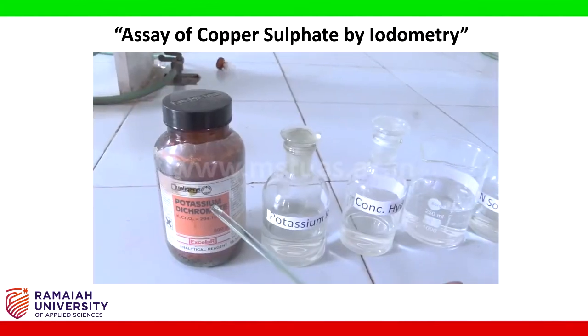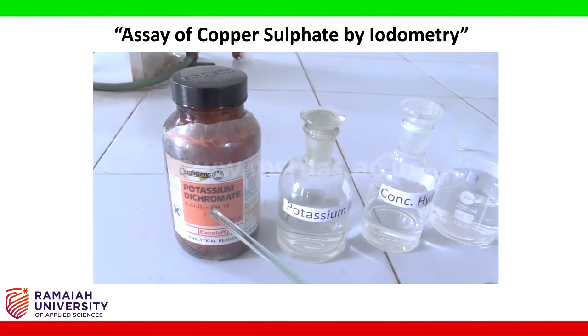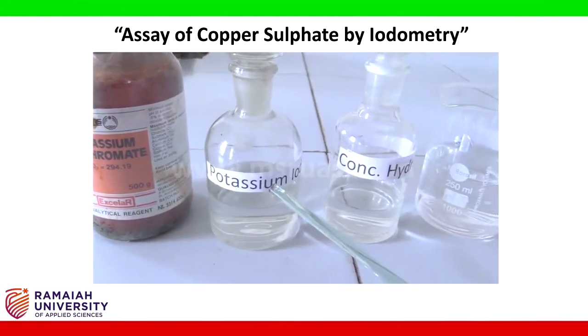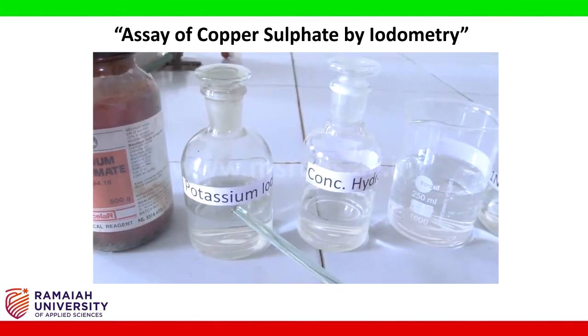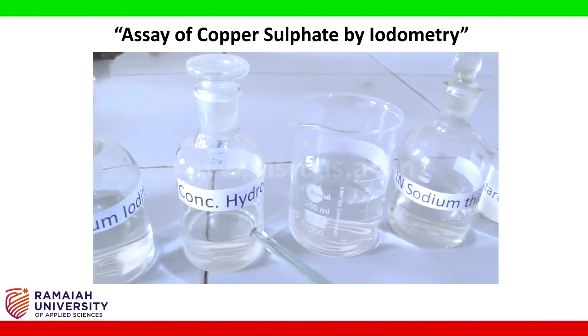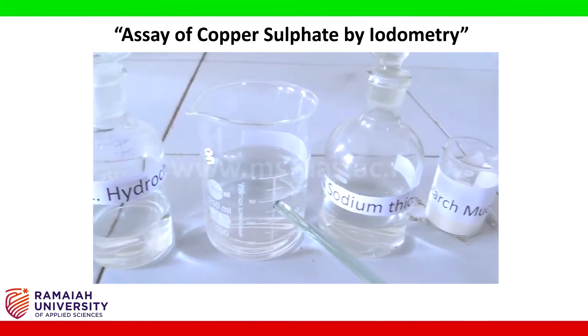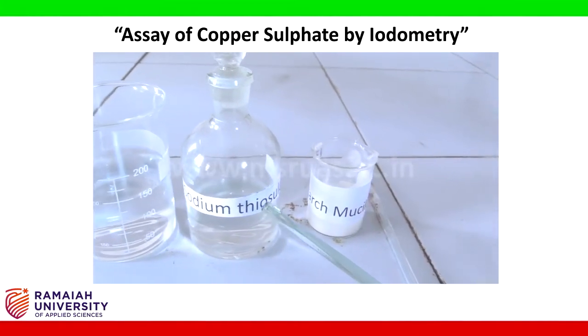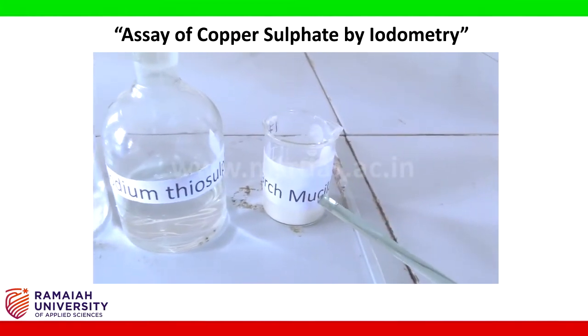For standardization, chemicals required are potassium dichromate, potassium iodide solution 10%, concentrated hydrochloric acid, distilled water, 0.1 normal sodium thiosulfate, starch mucilage.